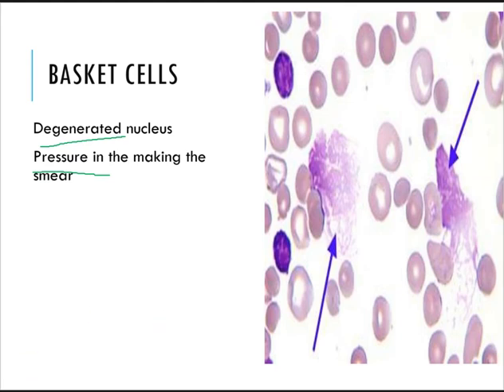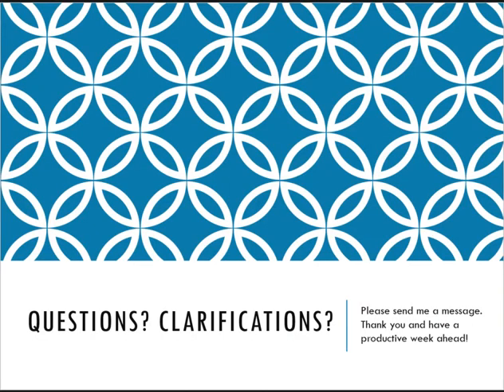I hope you learned something. Just a quick review. We talked about the history of the microscope, the parts of the microscope, the different types, the care, handling and storage of a microscope. We also discussed your peripheral blood smear under your LPO, HPO, and your OIO. We also tackled, as a quick side note, your different blood cells and your abnormal blood cells.